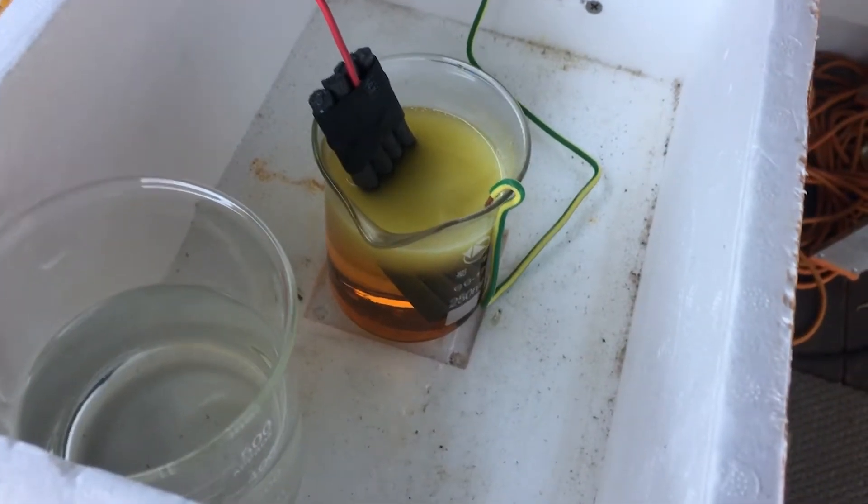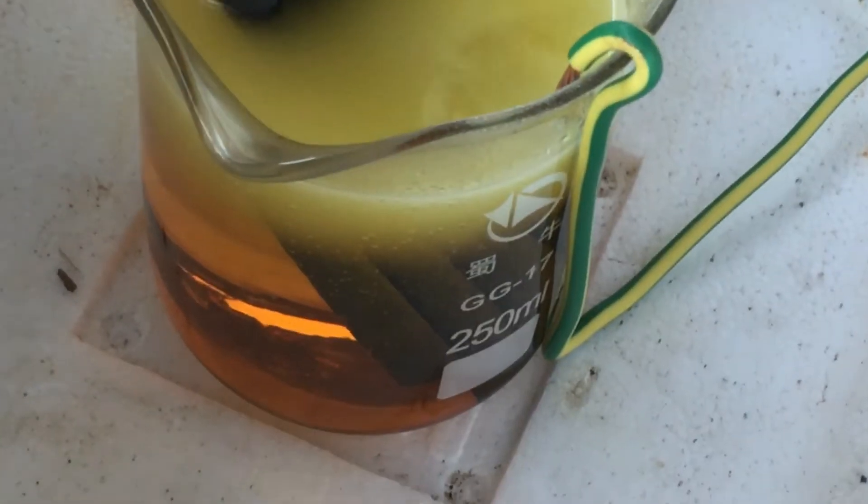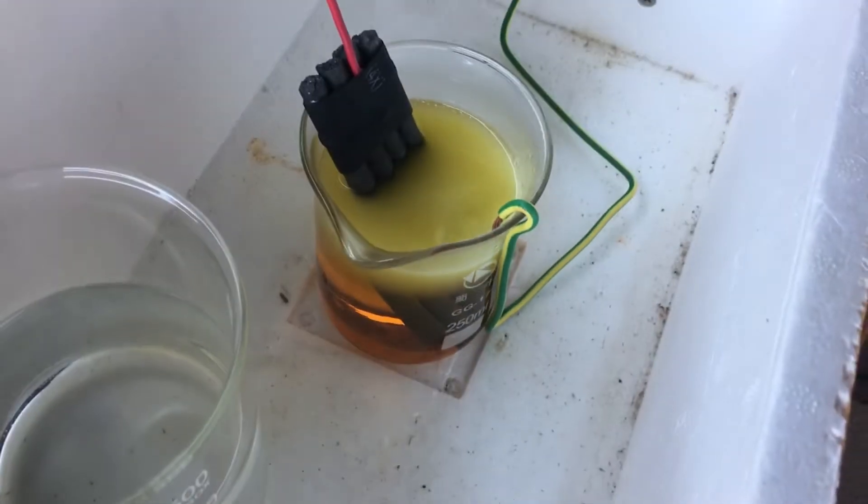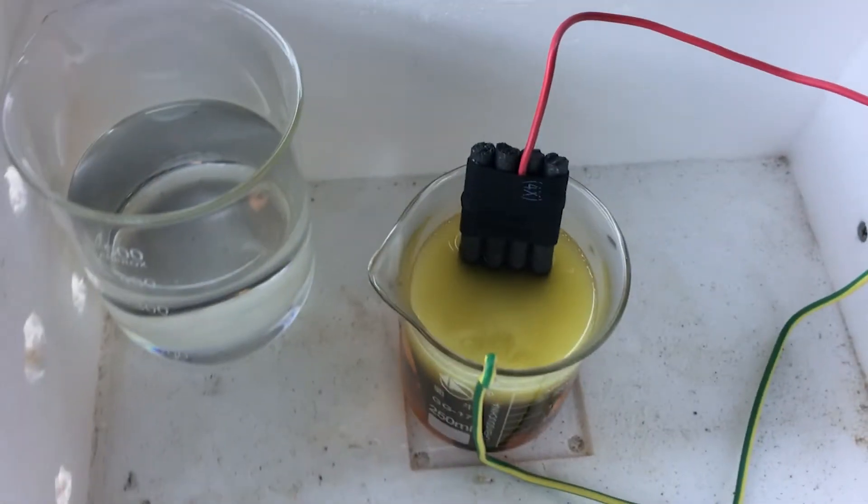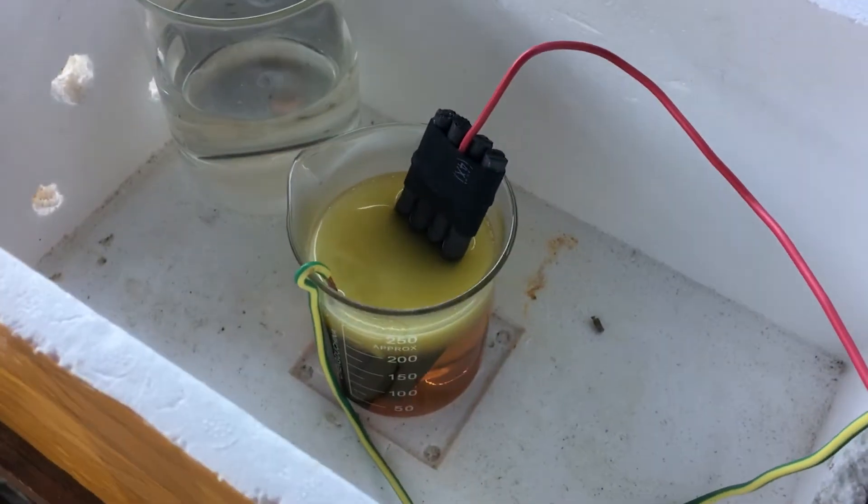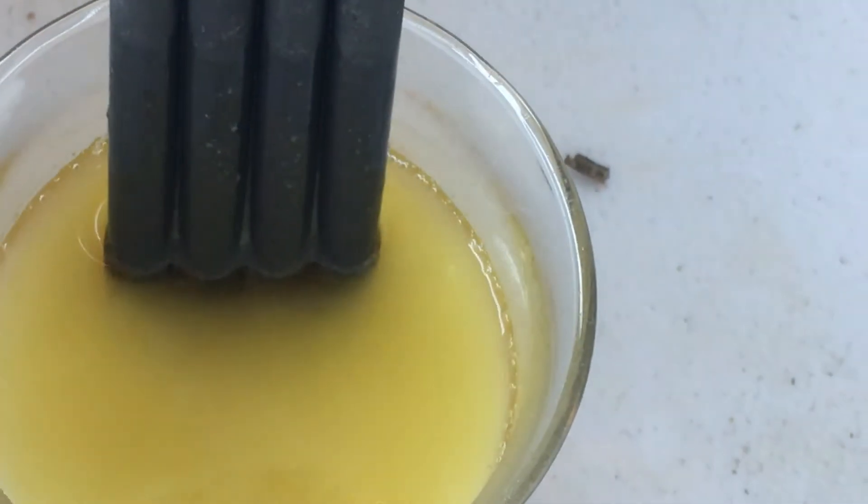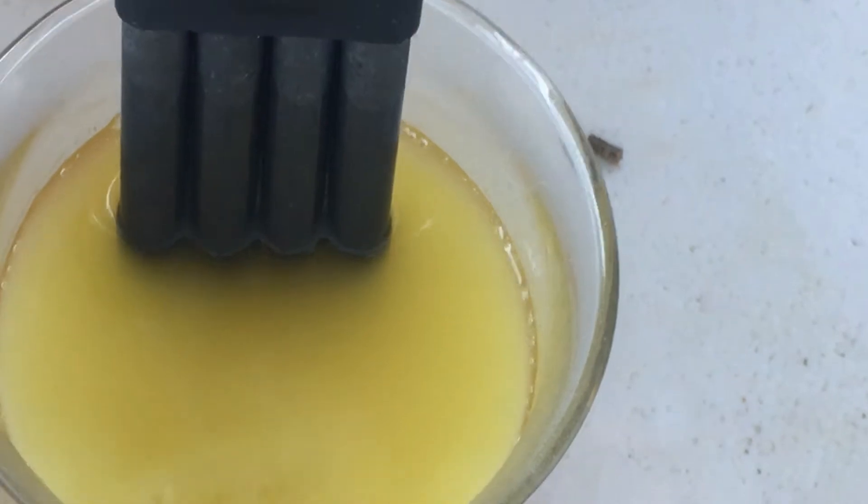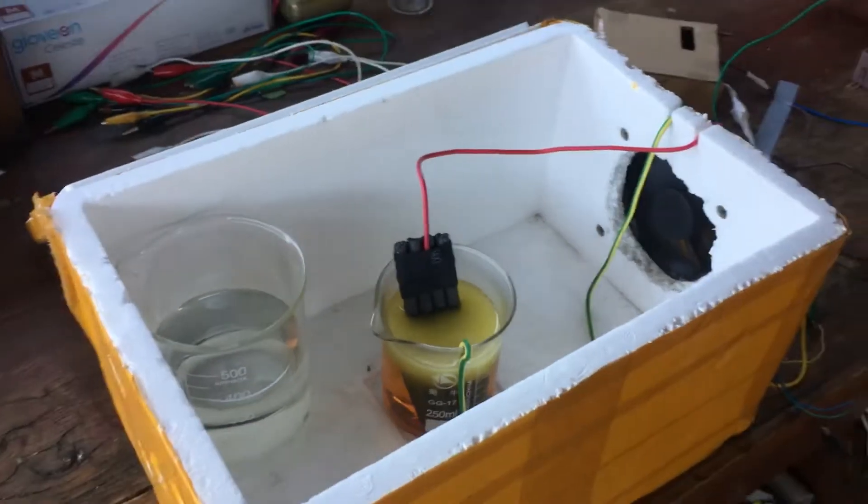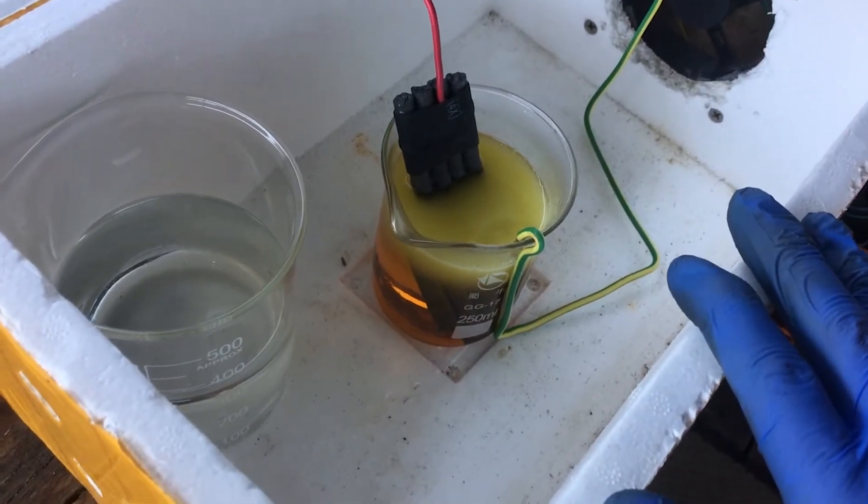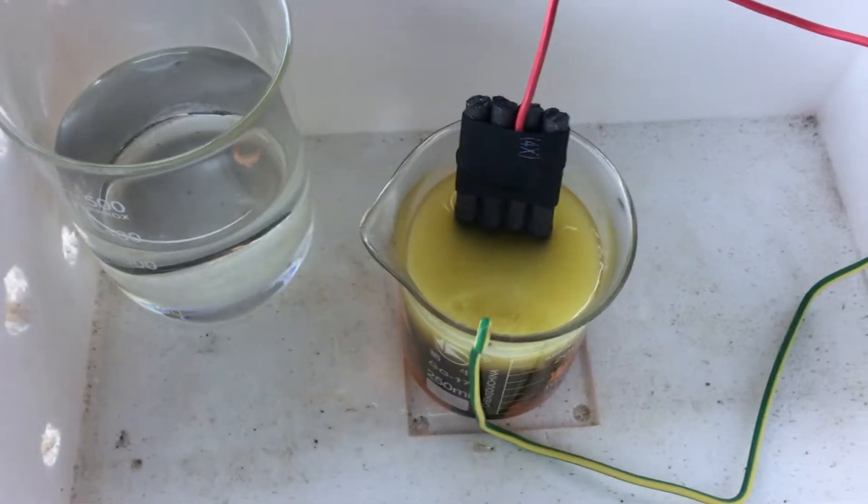One other thing to note at this stage is the fact that the graphite electrodes really seem to be holding up really well. I was expecting them to kind of fall apart, even just a little bit by this stage, but as you can see there, they look pretty much untouched so far. We'll see how well they'll hold up for the rest of the run, but hopefully they'll do a good job.